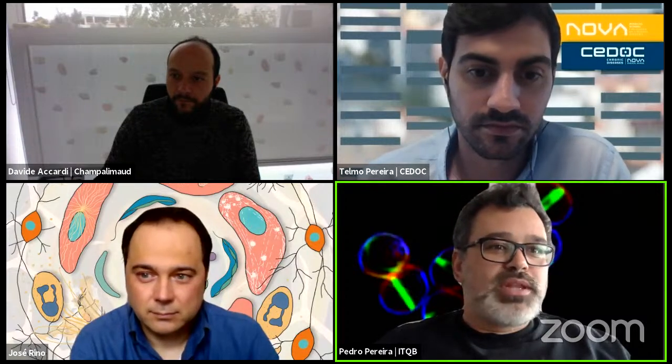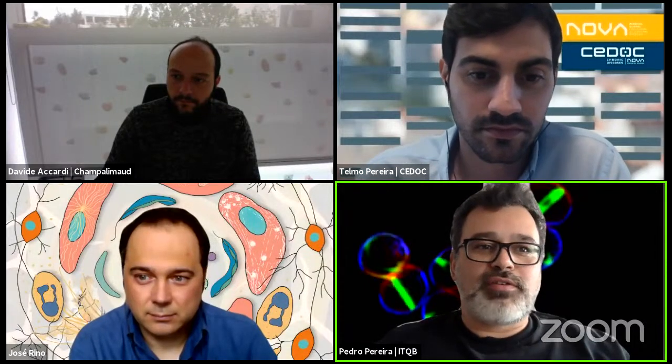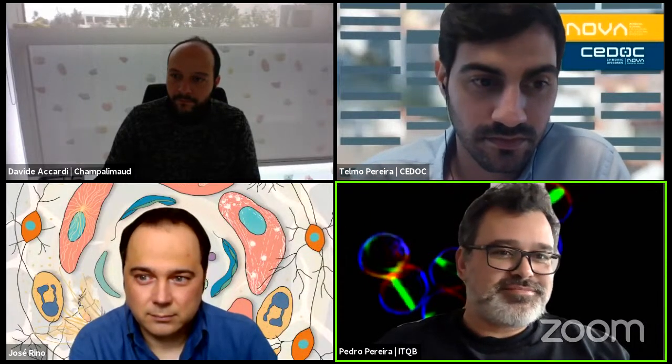So we have a question by Dinesh. What should be the minimum Stokes shift value for IHC double staining with GFP and Alexa Fluor 555? Very specific. But maybe let me read this. It's in the chat.